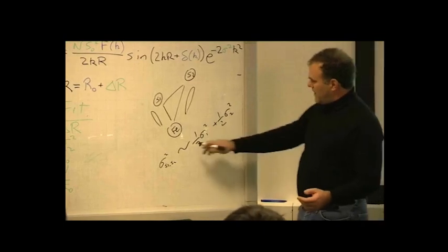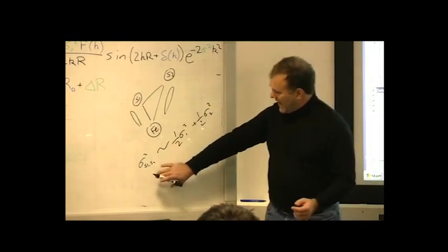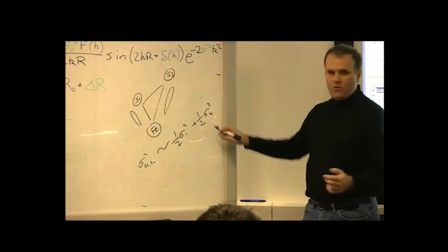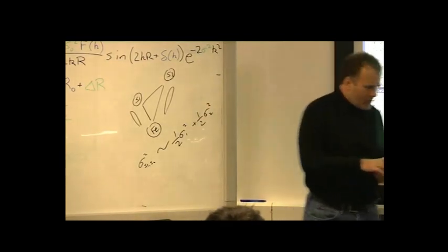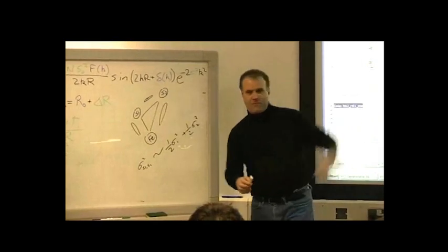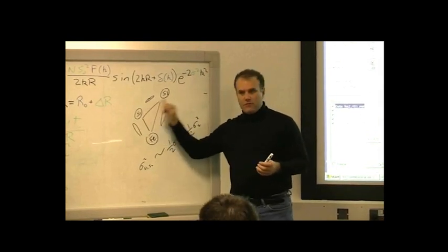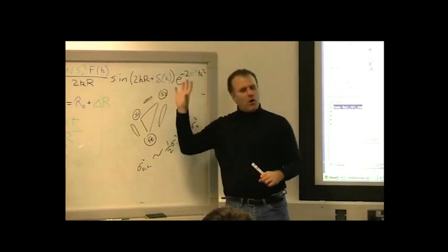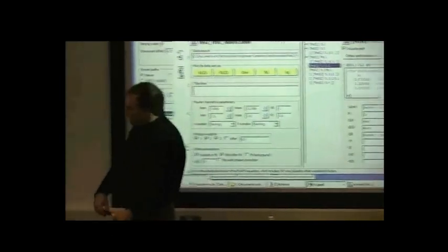What I mean by this is not a near equality. What I mean is that there must be some relationship between the sigma squared for this path and these two sigma squareds, with a factor of half because it's half as long, or something like that. But then there's this bit that we don't really know what to do with, because we don't have a single scattering path in the fit, obviously, that relates to the sigma squared associated with this leg. I mean, we don't have a piece like that in the fit. But that's sort of the unknown part, but it's a small part of the fit. So I'm troubled introducing a whole new parameter, but I'm troubled because I don't quite know the relationship.